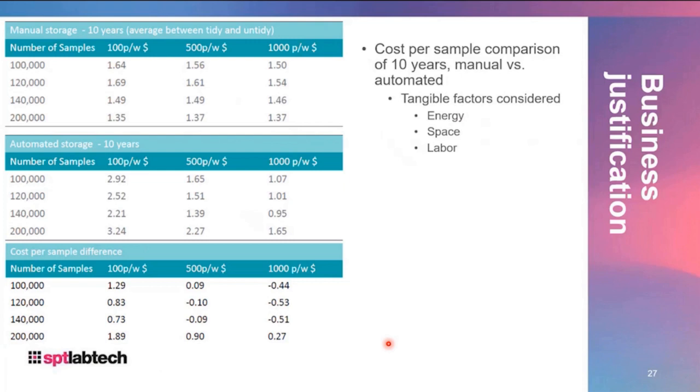And just as an example to consider: just because it's, in certain cases, more expensive per sample to automate doesn't mean it's not worth it to your business. So really factor in the intangible costs as well as the tangible to meet your whole picture.